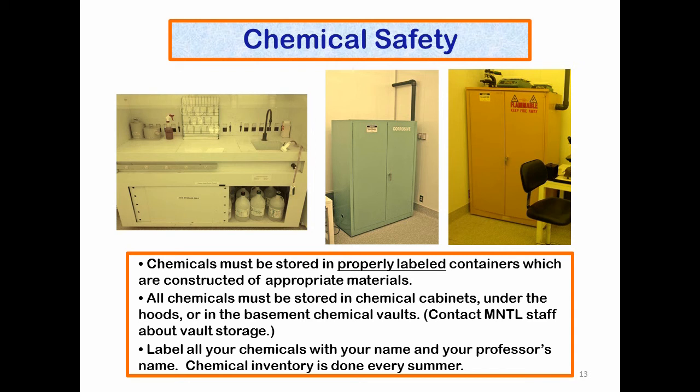All chemicals must be stored in chemical cabinets under the hoods or in the basement chemical vaults. You can contact MNTL staff about vault storage if you have quantities of chemicals to store. Label all chemicals with your name, your professor's name, the date, the purpose of the chemical mix, and be aware that chemical inventory is done every summer so that anything that is out of date will be removed.